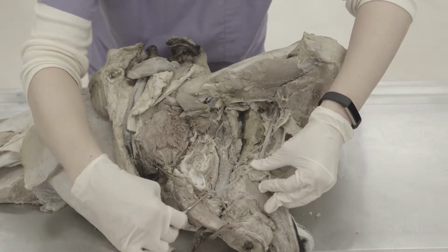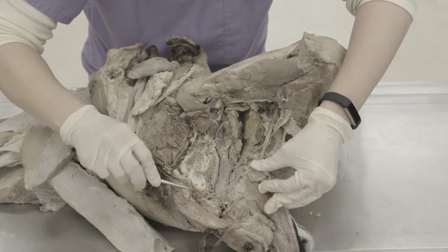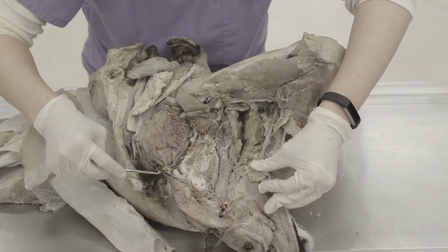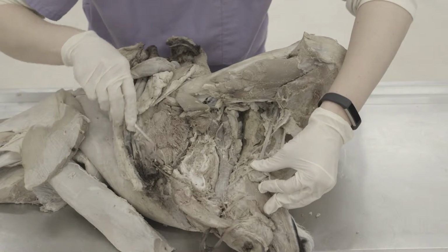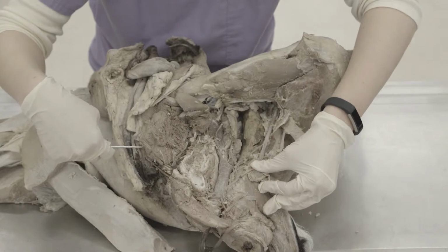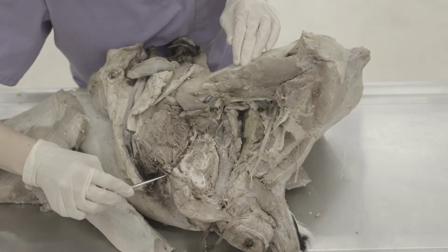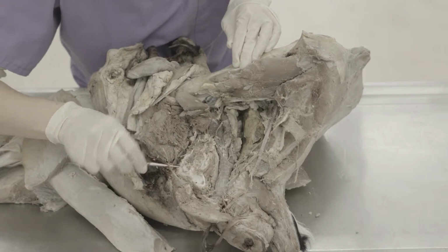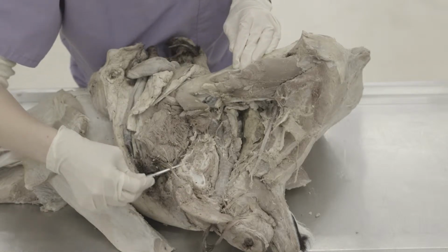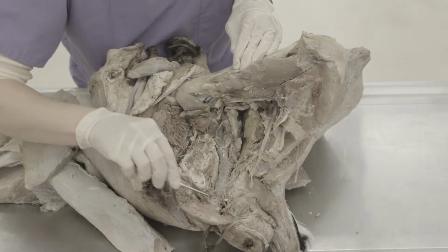So that would be right here. Then that will give off a couple of deep branches and then continue as the dorsal artery of the penis right here. And in this poor little calf, it's pretty chopped up down here, so it's hard to trace that all the way down. Also right here, I want to point out while we're right there, you would also have the dorsal nerve of the penis, which is right here, and that would come off of the pudendal nerve, which is going to run in that same area here.